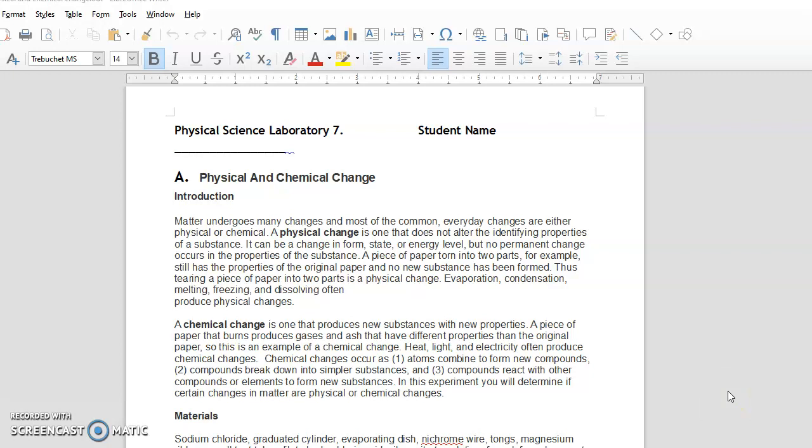This is going to be an experiment in more ways than one. We're going to see how well we can do with a laboratory when I have to essentially just narrate what's going on in the lab. And I'll also mention to you what occurs at certain times. You can record those observations and tell me what you think about them. You're responsible for making the conclusions and the write-up of the laboratory itself.